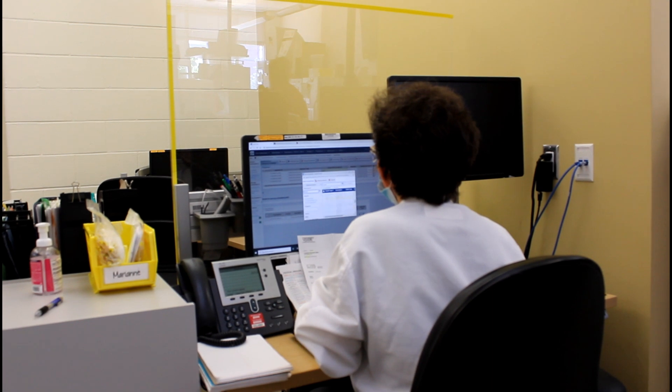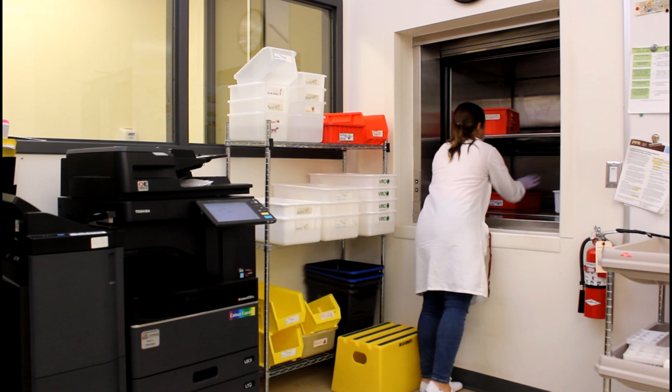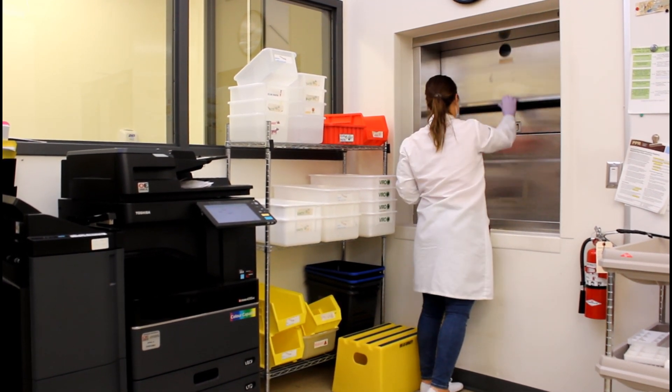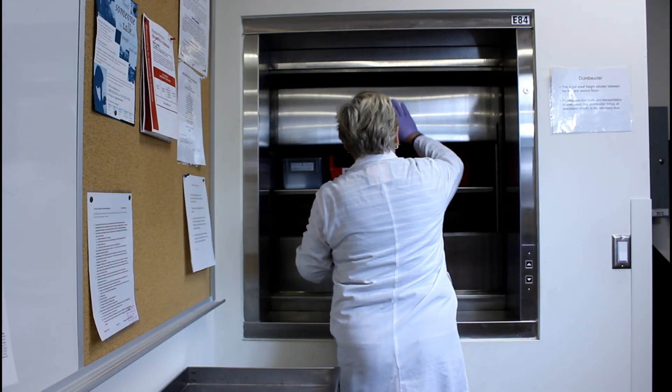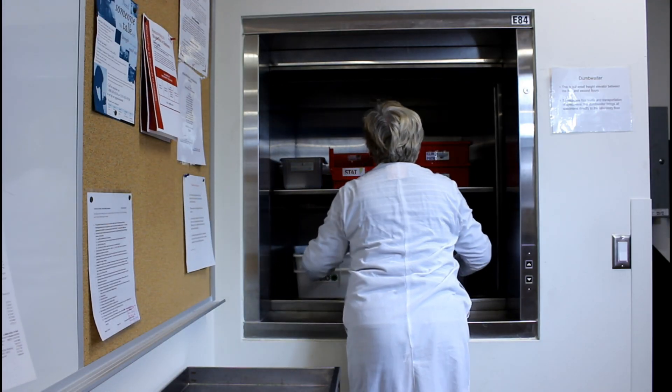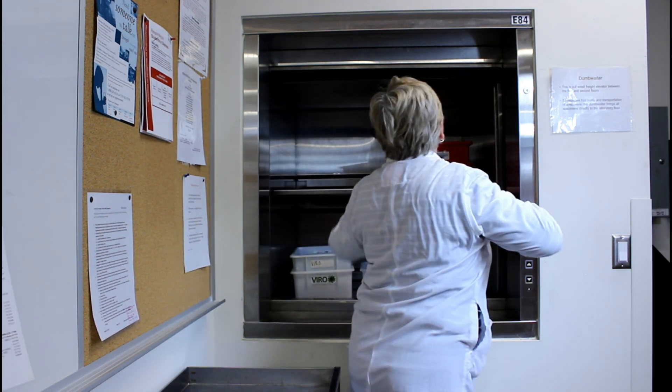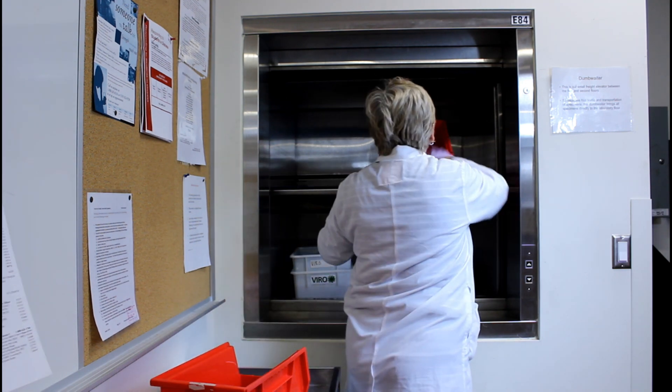Then the samples are entered into the computer system and sent up to the lab section. You can see here our staff are sending our samples up via the dumbwaiter to the second floor. When the samples arrive on the top floor they get to the bench and go through a second phase where they're double-checked for accuracy, and then they go on to testing after being checked in again.